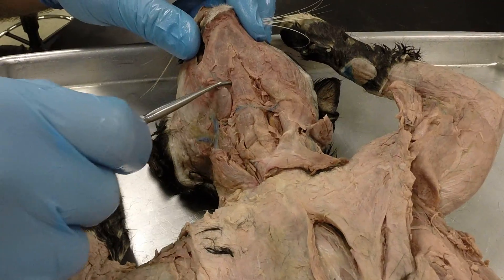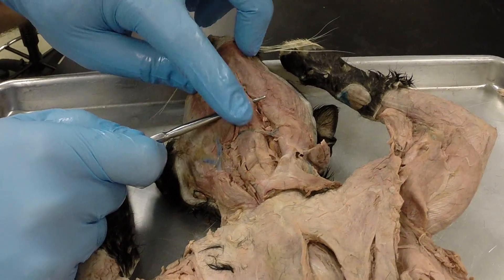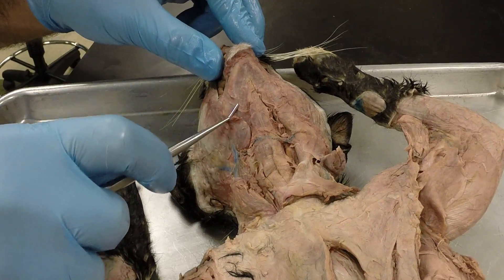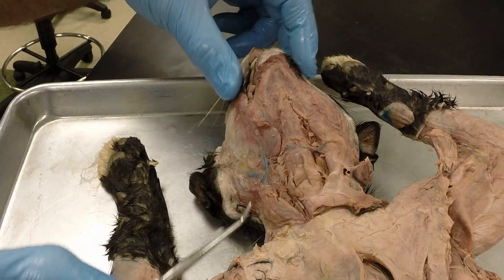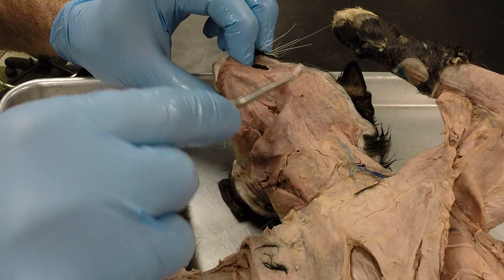Following up, we have this muscle in the middle called the mylohyoid — think M for middle, M for mylohyoid. Then you have muscles forming kind of an upside-down V inferior to the jaw — these are the digastric muscles. Then we have this large cheek muscle, which is the masseter muscle.